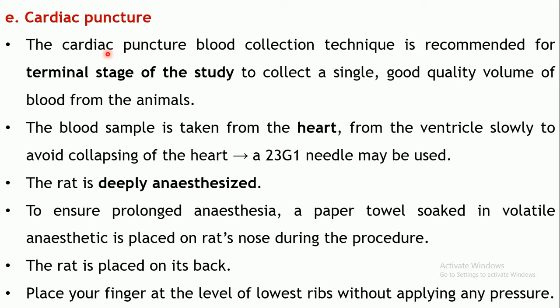The fifth method is cardiac puncture. Blood is collected from the heart and this method is recommended at the terminal stage of the study, allowing collection of a single large volume. After collection, the animal must be sacrificed. Blood is collected from the ventricles using a 23 gauge needle. The animal must be deeply anesthetized throughout — a paper towel soaked in anesthetic can be kept near the rat's nose to prevent it from regaining consciousness.